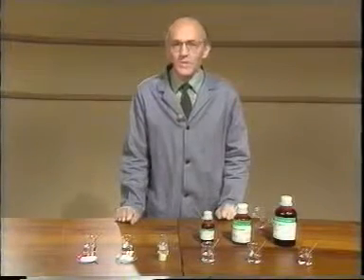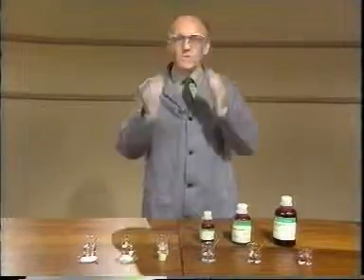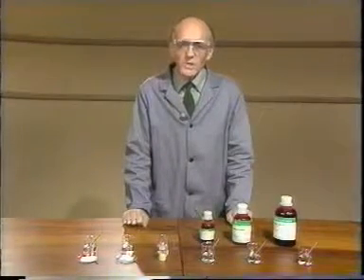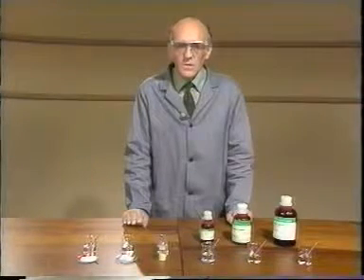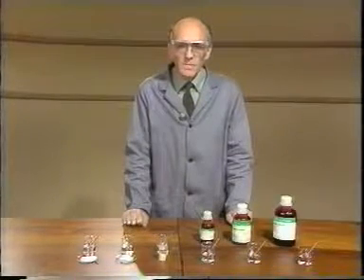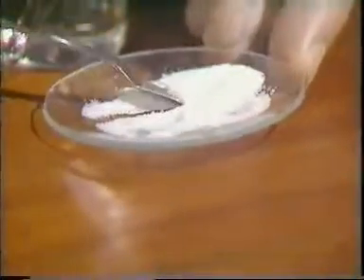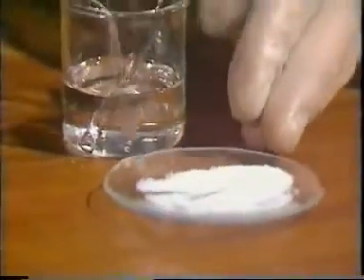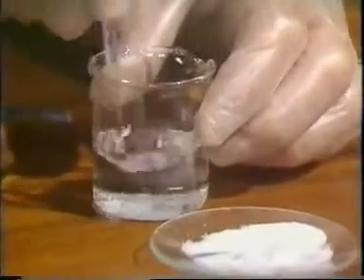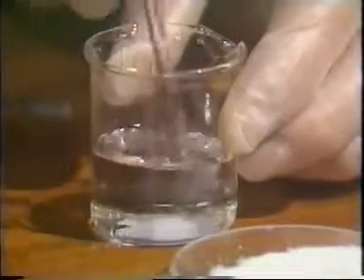Now I'll perform a similar series of experiments using hexane instead of water. That should give you some idea of the bonding in the substances. Now you know that sodium chloride is ionic and that's why it dissolves in water. But what about a non-polar solvent such as hexane? If I add some sodium chloride to hexane and stir, there's no sign of the solid dissolving at all.